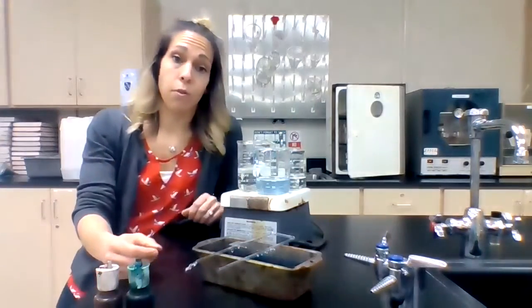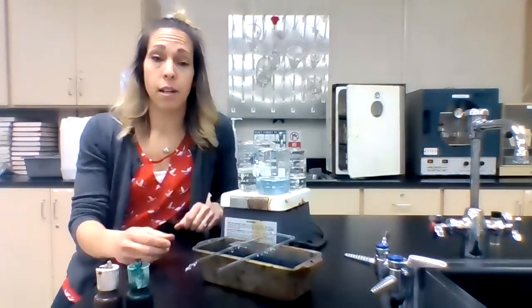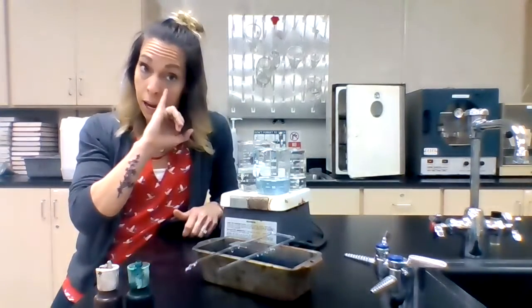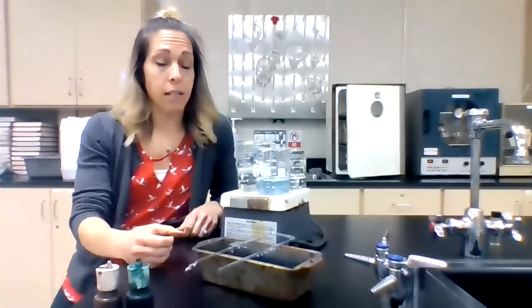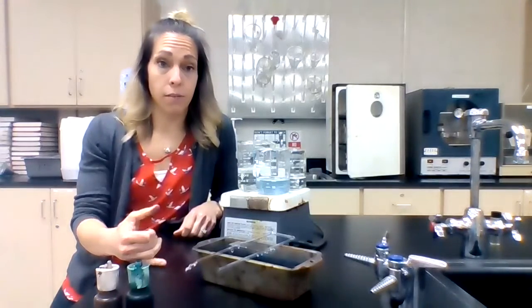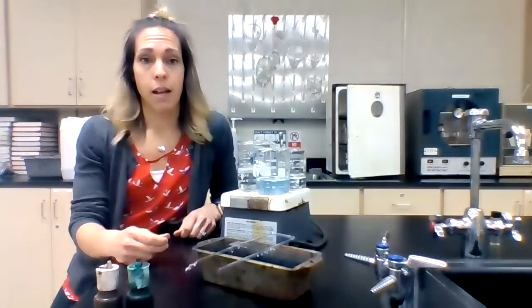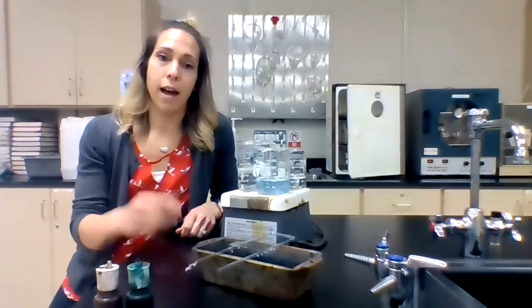And when you look at it under the oil immersion lens, you're going to be looking for 2 results. If it's completely pink cells, that's spore negative. If you have pink cells with green around them or green on either end or some green cells, that means your bacteria is spore positive. So pink is going to be spore negative. Green and pink is going to indicate that it is spore positive, and that is your spore stain.